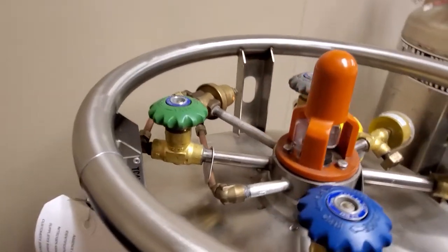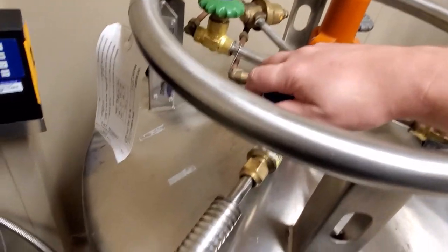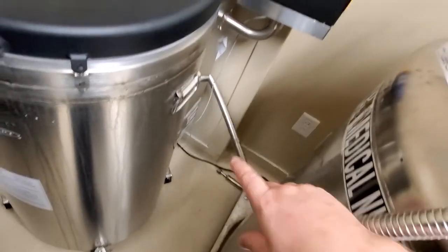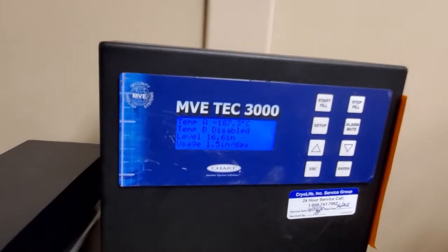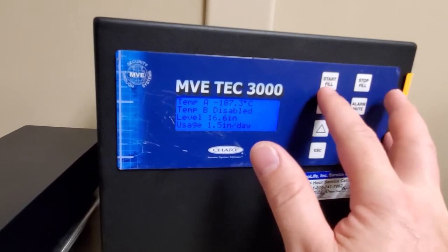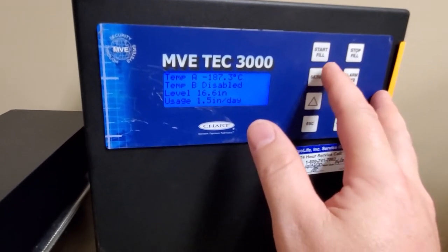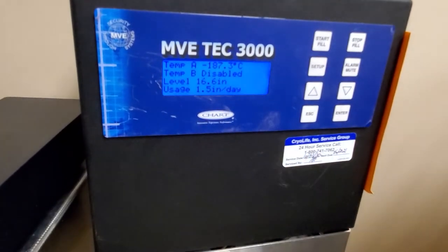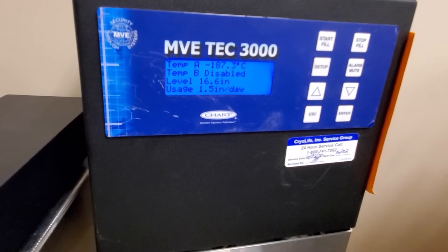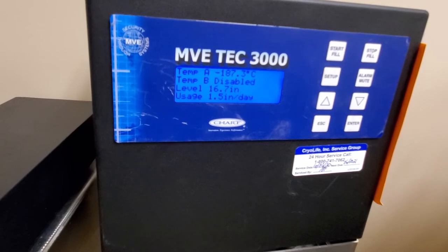This tank is very similar — see the green knob for pressure building. This is your master knob to allow dispense down to your freezer. On this controller you can see start fill and stop fill. All you normally have to do is hit start fill and you are good. If you see the level, I've got 16.6 inches, and you can see the usage is 1.5 inches per day — so that's actually pretty good.